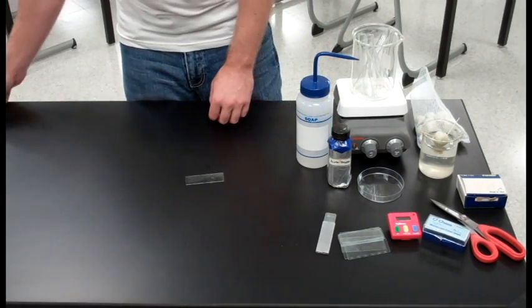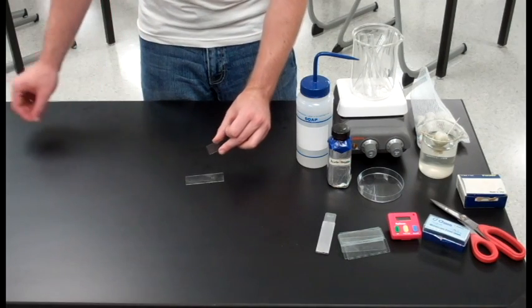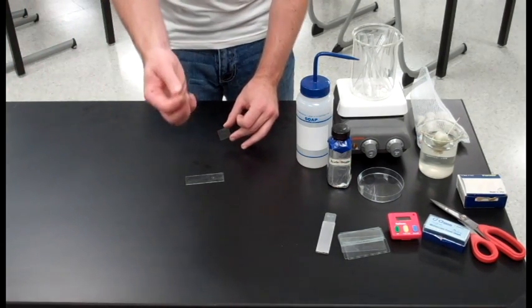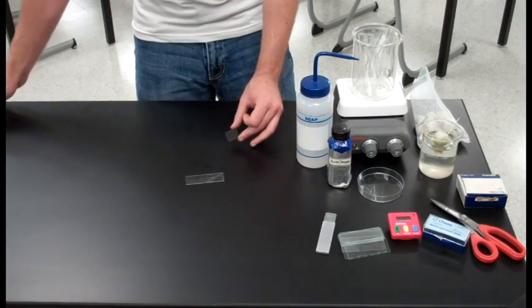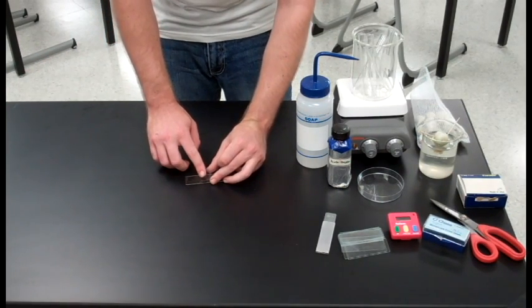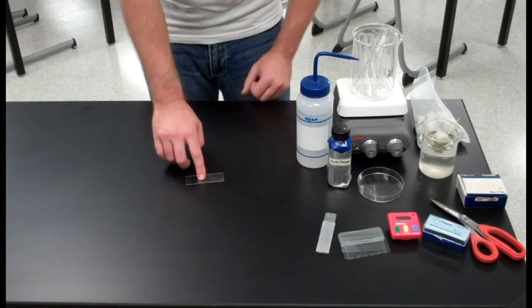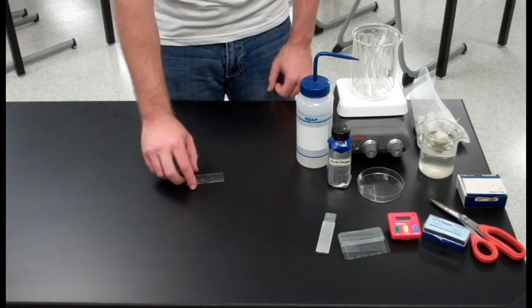The next step is going to be flattening our sample. So take a cover slip or you can use the tips of your forceps or you can use the tip of a scalpel or anything else. But the important thing is to get it squirt. So press down firmly with one finger to flatten the sample.